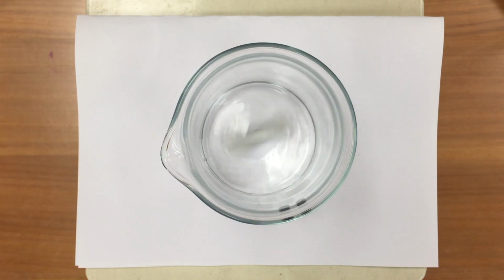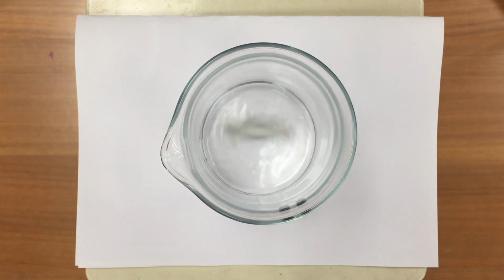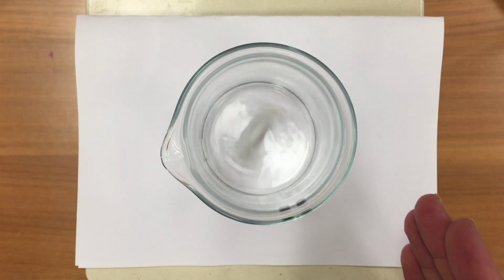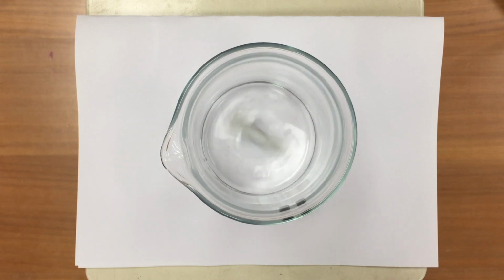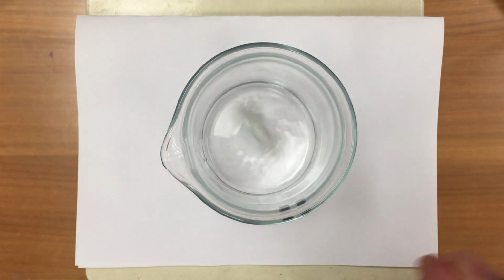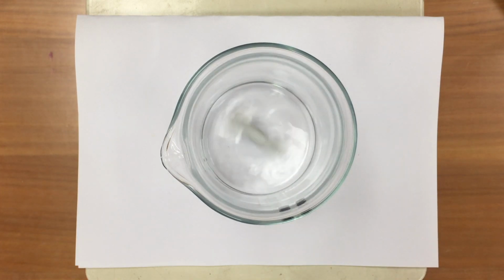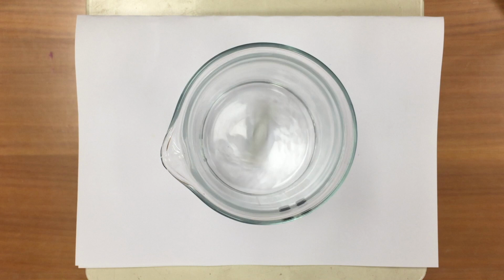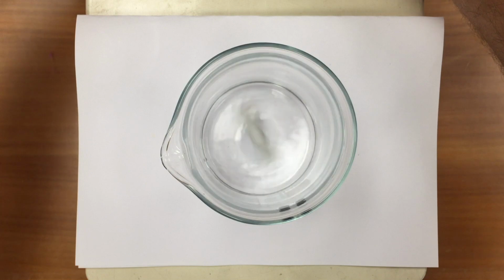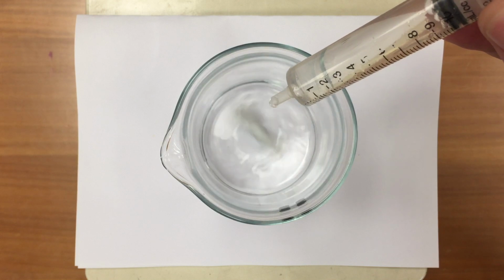What I'm going to do now, very carefully, is add drop by drop sodium hydroxide until I see a colour change. When my phenolphthalein goes from colourless to pink, that means my solution has changed from being acidic to alkaline or basic. That will mean that every bit of my hydrochloric acid has been reacted with, it's been neutralised, and the first drop that makes it go pink means my solution is then alkaline. There's no more hydrochloric acid left, the pH has gone from acidic to alkaline. So I'm going to add sodium hydroxide carefully, drop by drop, and I'm looking for the first permanent change to pink. So I've got 10 mils in my syringe there, and in it goes.